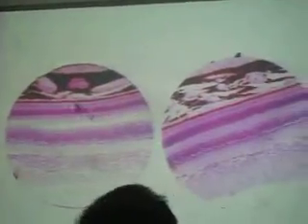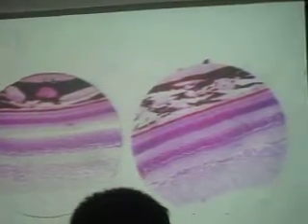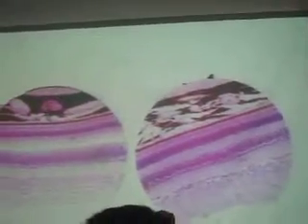So, again, this is your sclera. This is your choroid. Okay? This is your pigment epithelium. And then the rest are the 9 layers of the retina. Okay? The two-tone part there is your layer of rods and cones. It appears two-tone because you have the part where you have only the rods, and the part where you have the rods and the cones. Yeah, two-tone.